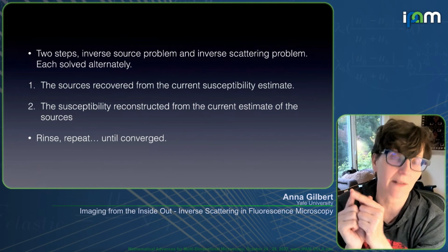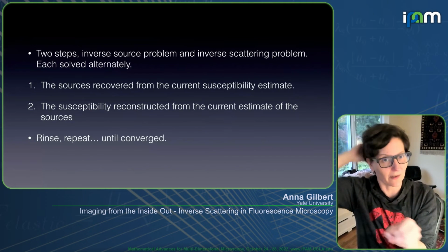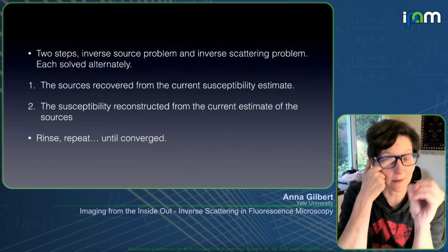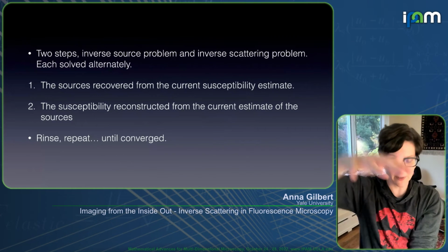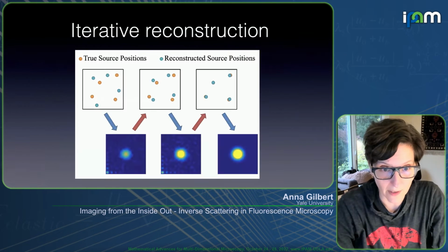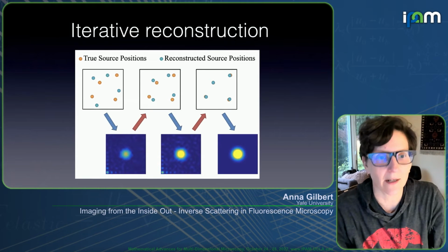inside the object that I'm trying to image, a better picture than simply using the information about where the sources are. I mean, and not just simply taking stacks of images with just a few sources lit up in each one and smashing them together. So here's a cartoon picture.